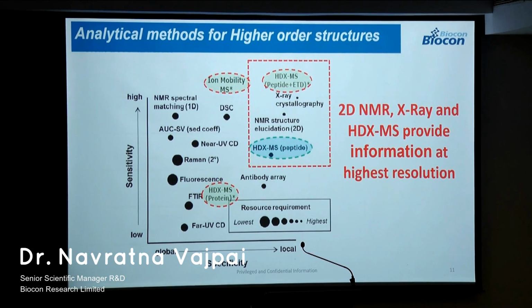And if you look at it, the 3 or 4 important techniques which provide you the highest resolution information, which is about the local information, are HDXMS, 2D NMR, X-ray, and of course the recently evolved HDXMS with the ETD, which provides you residue specific information.